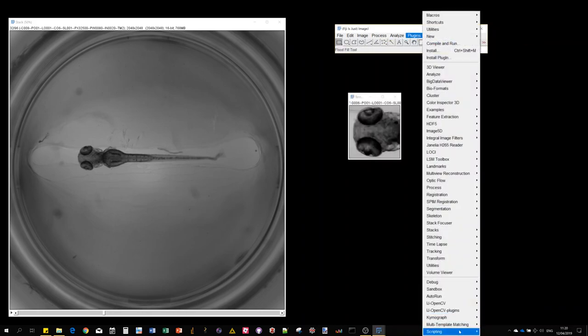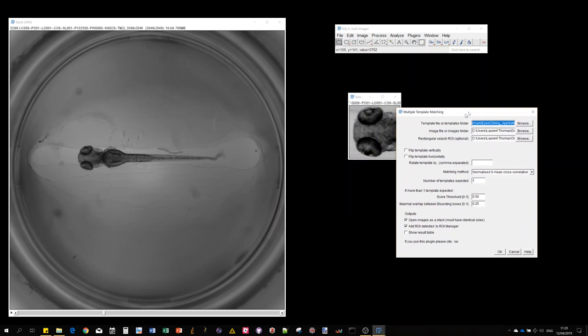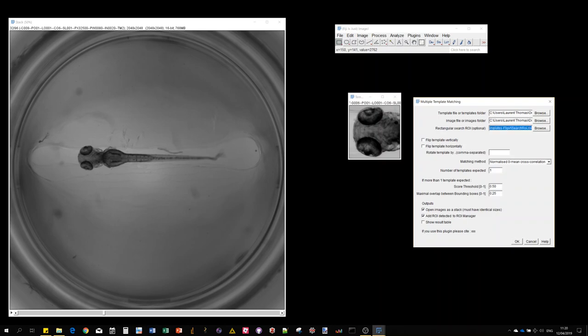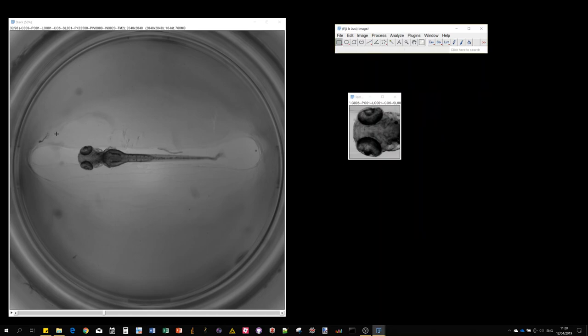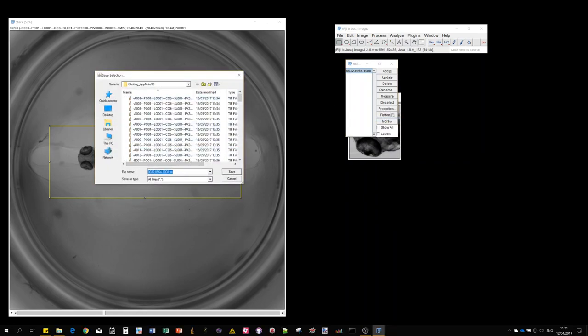The template matching folder is similar to the initial one except the input can be a file path to a template and image file, or a path to a folder. If you provide a folder, every image in the template folder will be used for the search, and every image in the image folder will be searched. You can also provide a search region, but because we're doing batch processing, you have to point to a .roi file instead of drawing. You just draw it, press T to add it to the ROI manager, select it, do more > save, and save it to a local directory.